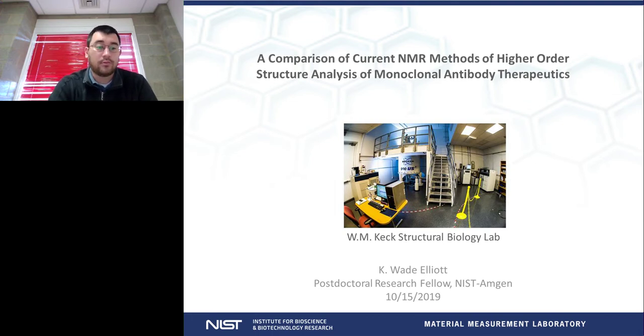I am a research chemist at the National Institute of Standards and Technology, and I'm going to be presenting some data on some of the current methods and metrics for chemometric analysis of NMR spectroscopy methodologies for analyzing monoclonal antibody therapeutics in their higher order structure.